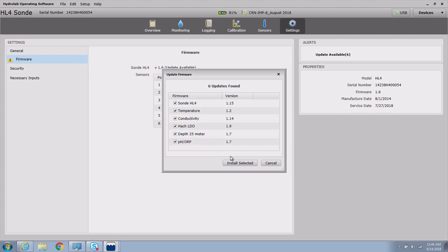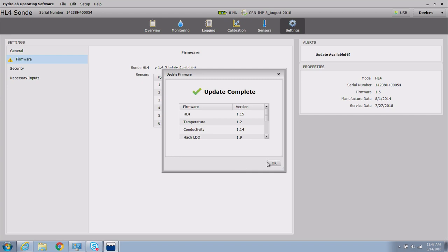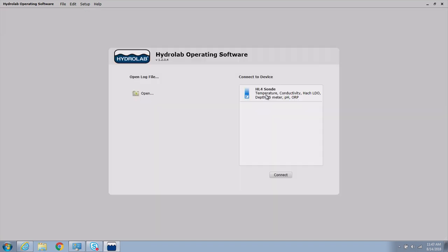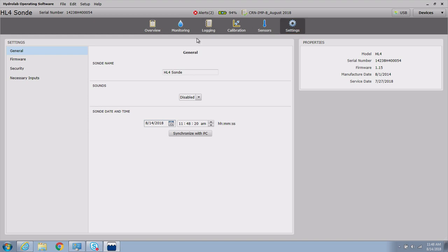When a sonde is connected and updates are available, it is recommended to proceed with all updates. The sonde's updates can be confirmed by selecting the Update Firmware button in the settings menu.